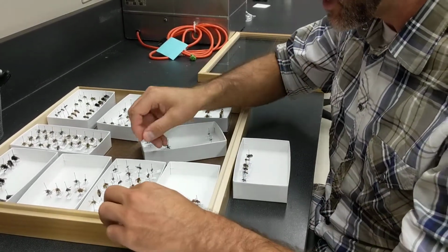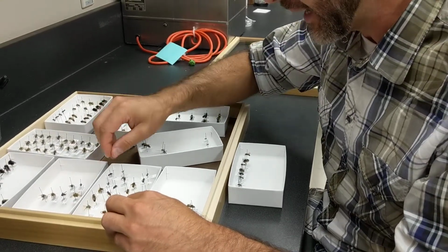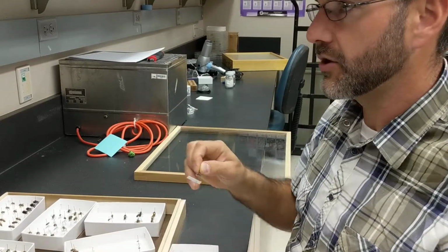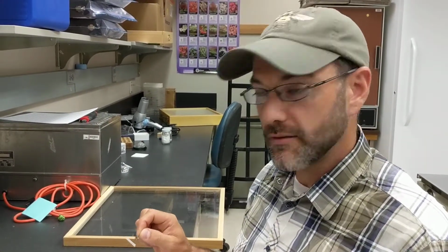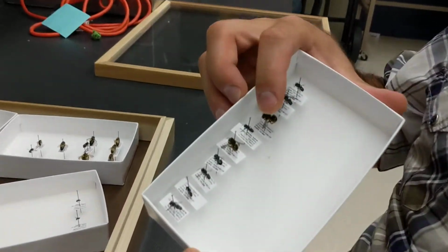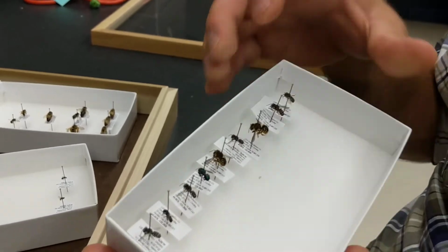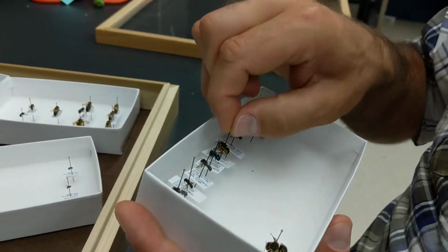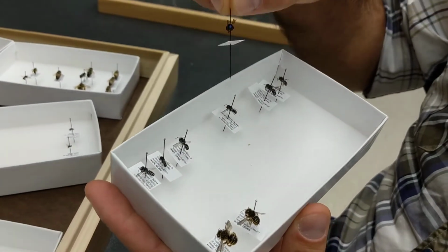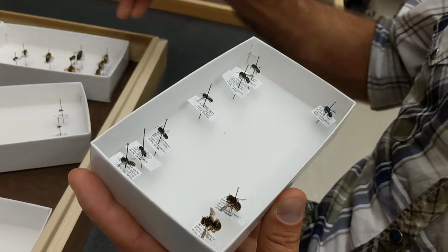You might do it differently if you're not able to recognize which family they're in by eye. You might just pull out, say, European wool carder bees, because you can recognize that they're quite a bit different than all the other bees in your collection, right? So you pull out those things, maybe separate these. And because osmias are often able to be recognized by eye, all those shiny blue and green bees, you can put those separate into their own little category.